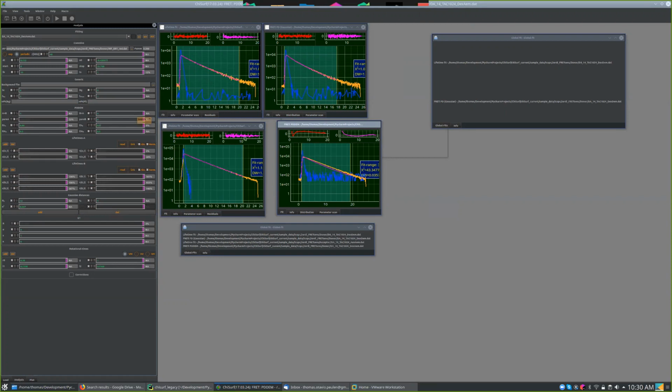So it seems like now we can, okay. Now we have to play a bit to find out what's going on. So let's say you have 100% acceptor excitation and only acceptor only. I am just playing with the parameters to see what's going on. So no donor excitation and no donor emission. So like this acceptor only decay, and you see it doesn't fit. So like meaning like this decay is slower, what you have here.